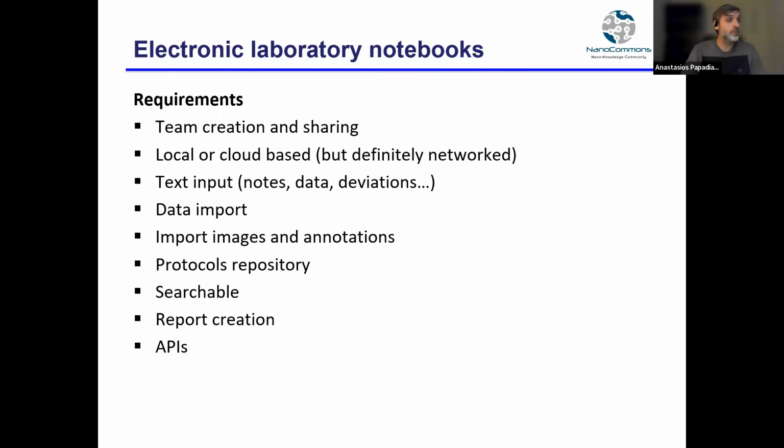So it would be best to have local or cloud-based solutions which are networked and which can capture the data and the protocols directly and can be accessible from different people that are given access to it.